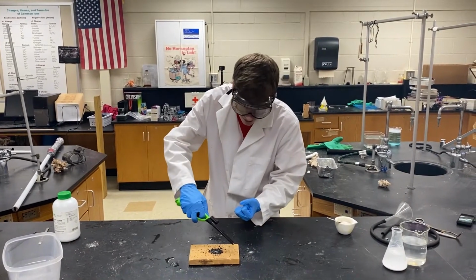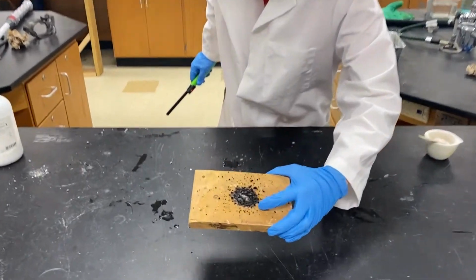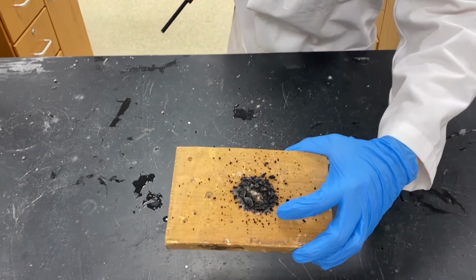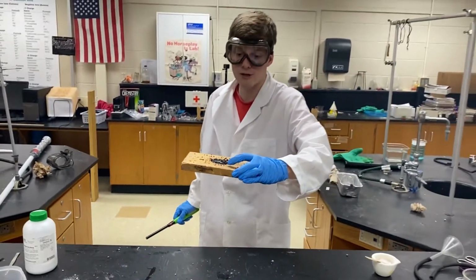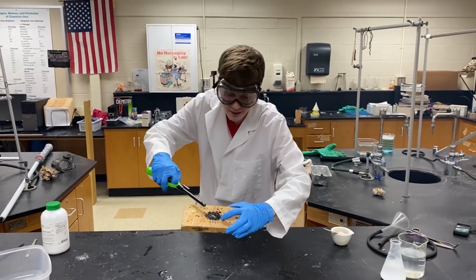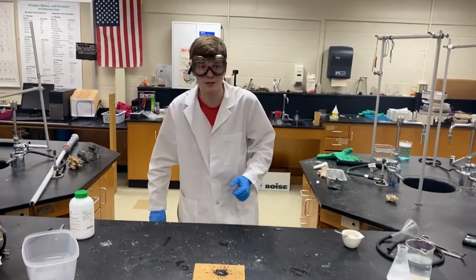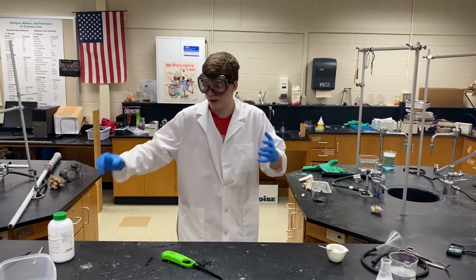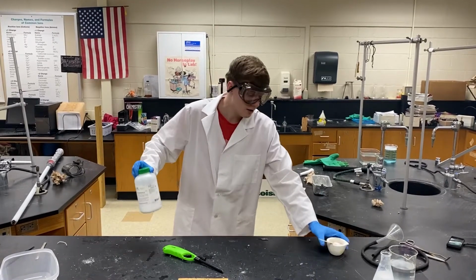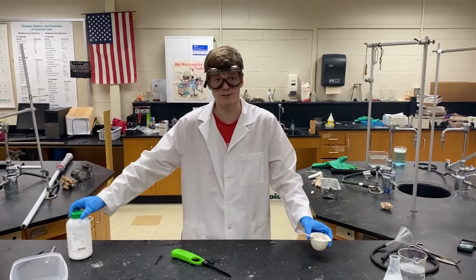If you know anything else about the formula there, what do you think this rest of this black stuff that's left behind is? If we're doing a combustion reaction, what should be left behind if combustion reactions create CO2 and H2O? Well, that actually might be a little bit of pure carbon that is left there. So when we see the sugar reaction, we should see a little bit of pure carbon left over. That is just a little bit of a reaction between potassium chlorate, our oxidizer, and our brown sugar here, and it produces a nice oxidation/combustion reaction.